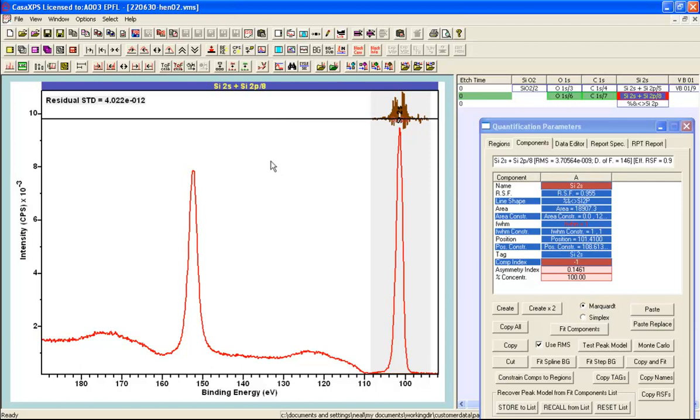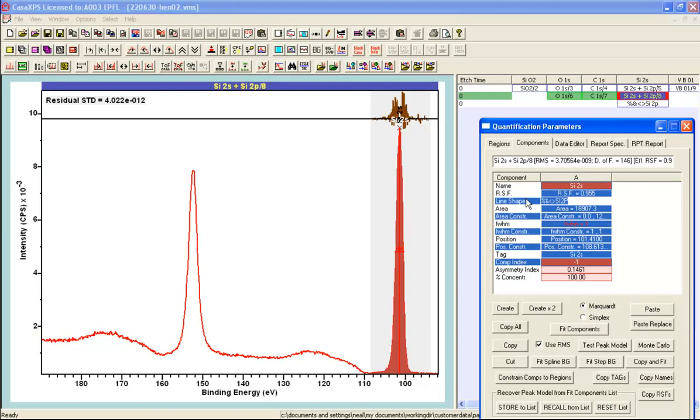So that is an example of how a simple peak model can be created from a line shape. But the most important thing to appreciate about a line shape from data is that the string entered into the line shape field must match a VAMAS block within this file, or it must match the string that was used in another file that has previously made use of a line shape with the same name that has been entered into a list of available line shapes.